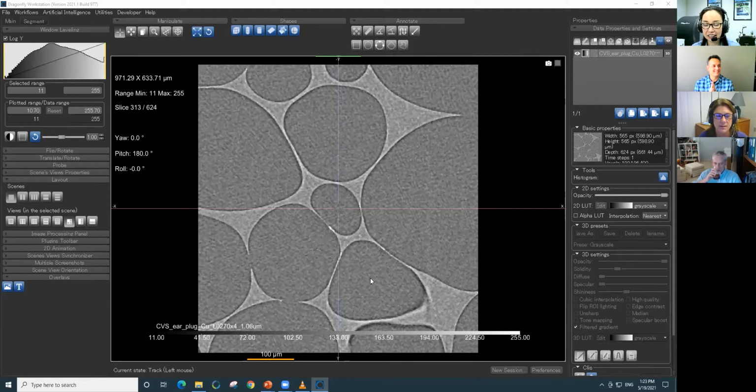So I'll just end this, and I'll share the results. You see it's pretty even for all. However, machine learning and Otsu binarization both are leading the pack. Okay, this is interesting. I thought that this would have a clear winner, but not really. That's good to know. We learned something. Okay, so let's start with the Otsu binarization. And then we can gradually change the way we do it, and you will see the difference.